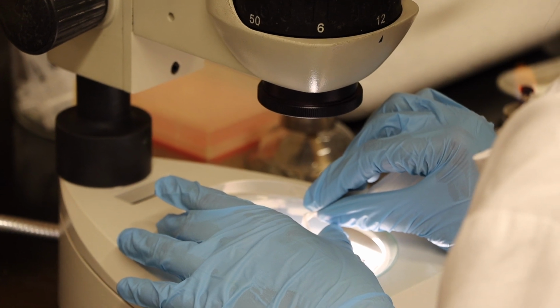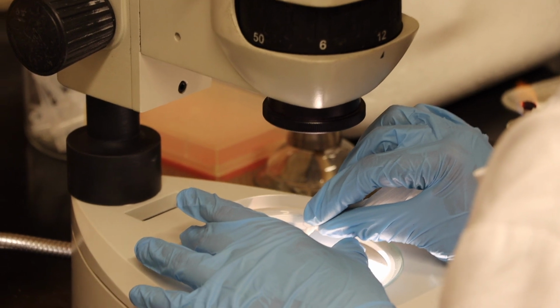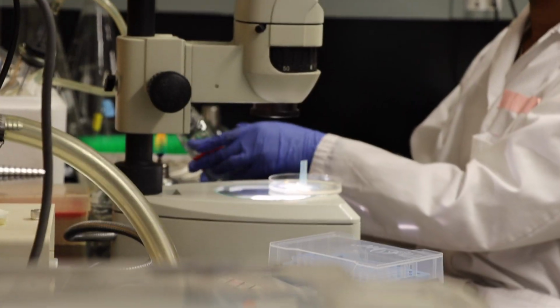In the second control, the worms will be zapped for a minute in the training stage without being exposed to the odor. The purpose of this control is to confirm that the worms won't experience any physiological damages from the zap, and to confirm that their response to the odor is not due to any deteriorating senses.